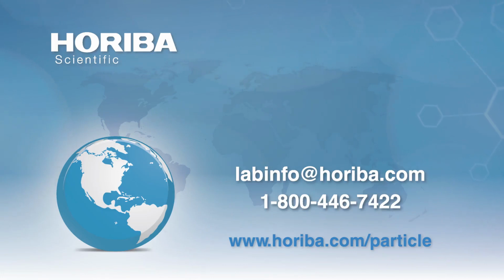The other thing is we're going to measure every particle in your system. So if you bring me a diluent that is loaded to the eyeballs with particles, I'm going to teach you how to clean it up, and then we'll run your sample. Yeah, so we need clean, but I can help with that. We've been through that a number of times.